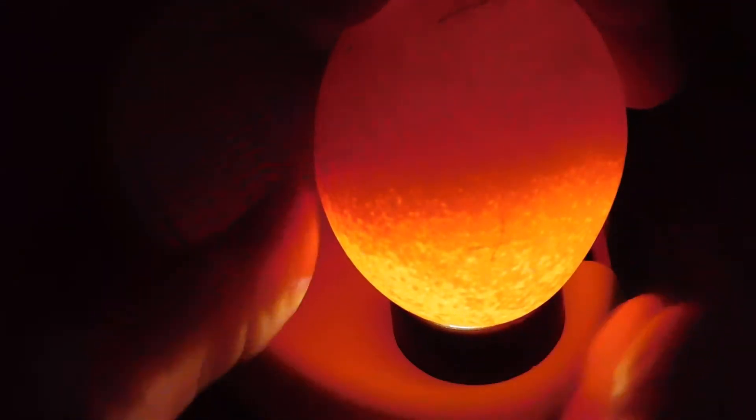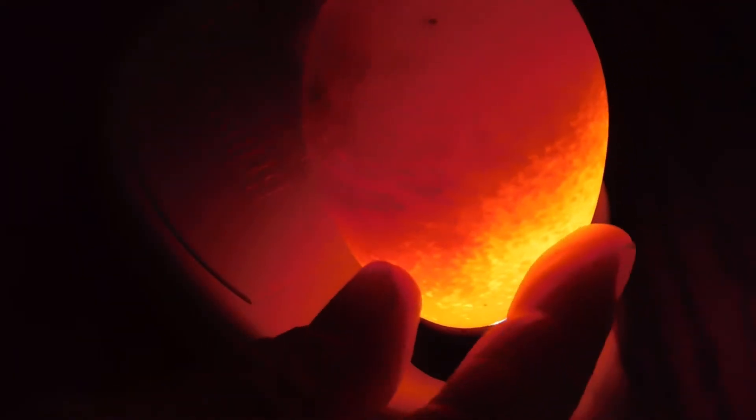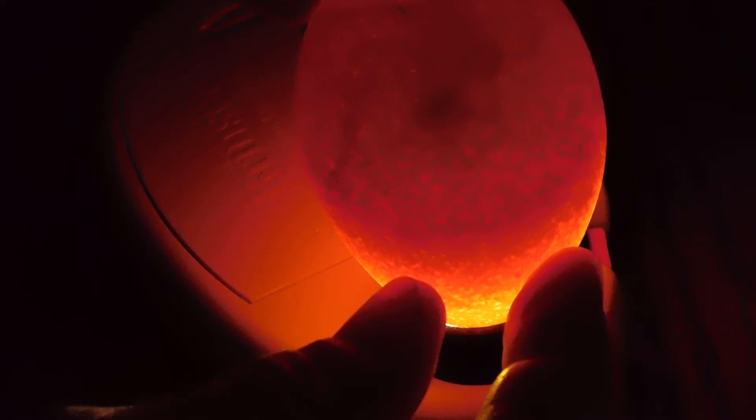Number four. Good signs. Definitely some veins growing. Definitely an embryo. Definitely an eye. A little bit of movement, but still growing.